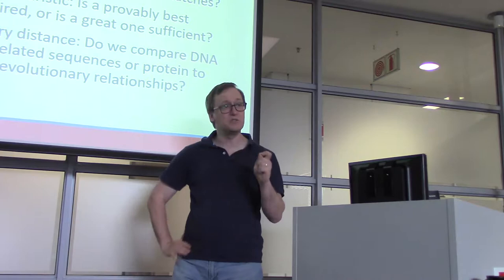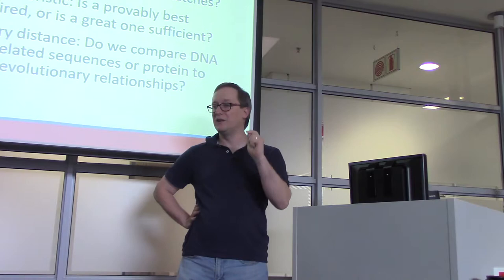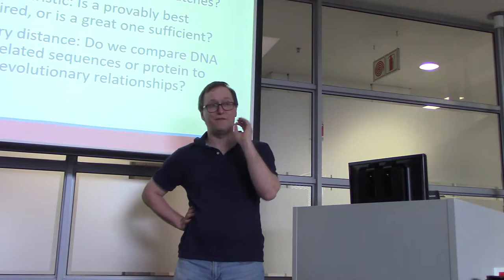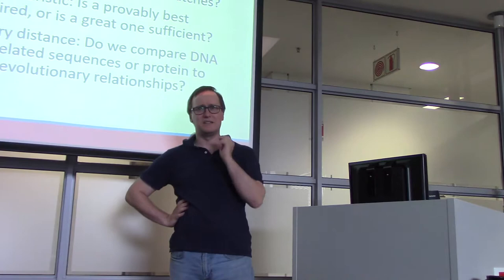But most of the searching we do, including BLAST, makes use of a heuristic approach, which is to say, we are willing to sacrifice a little bit of accuracy if we can win a lot of speed for it. BLAST is a fine example of this. It's extremely fast, but it is not guaranteed to give you the best possible scoring for each pair of sequences.